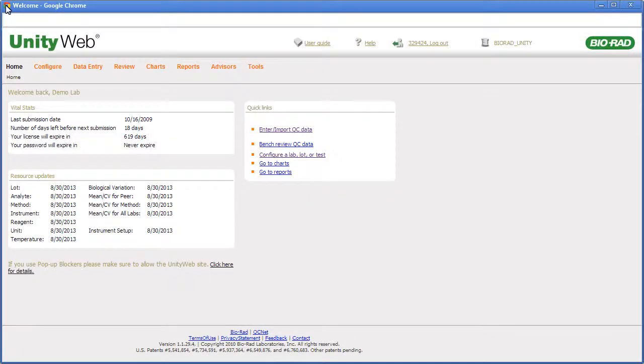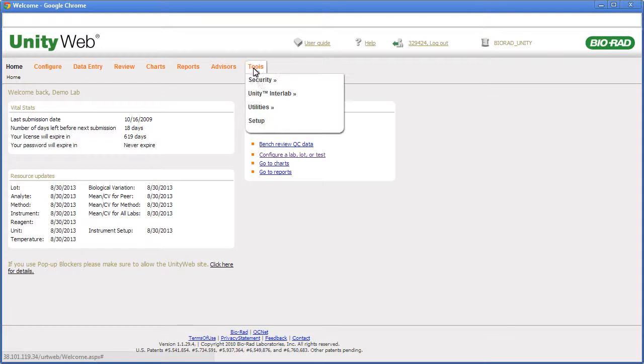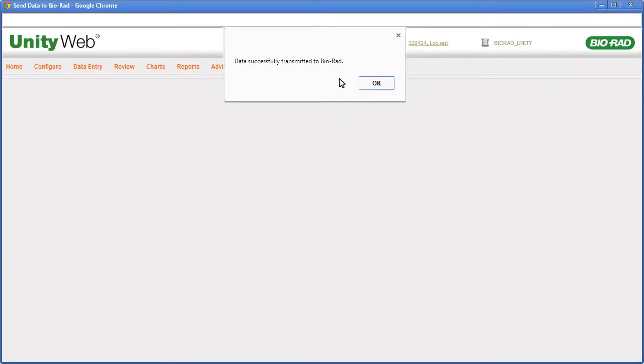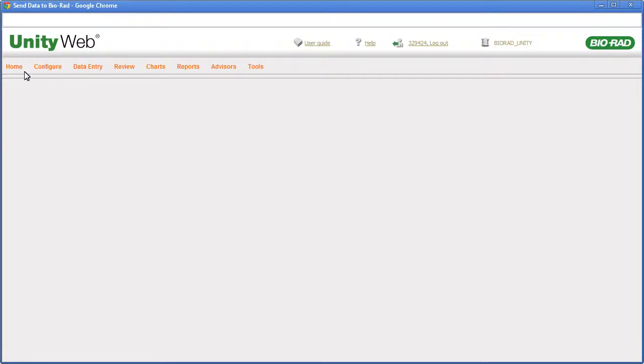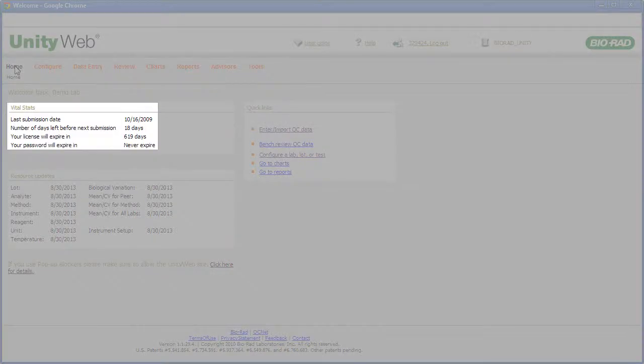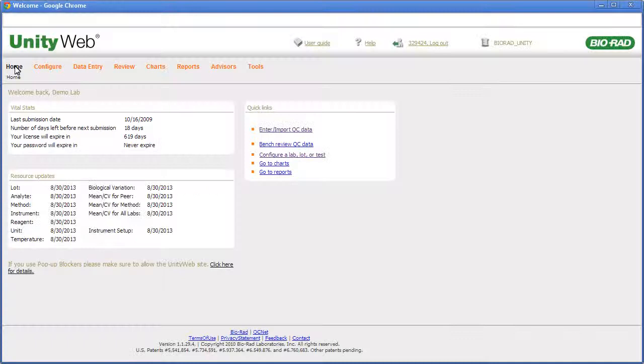When using the manual method, point to Tools, point to Unity Interlab, and click Send Data to Bio-Rad. A dialog box appears asking if you are sure you want to send data to Bio-Rad. A dialog box appears confirming that data successfully transmitted to Bio-Rad. Note that your home page shows the date of your last data submission.